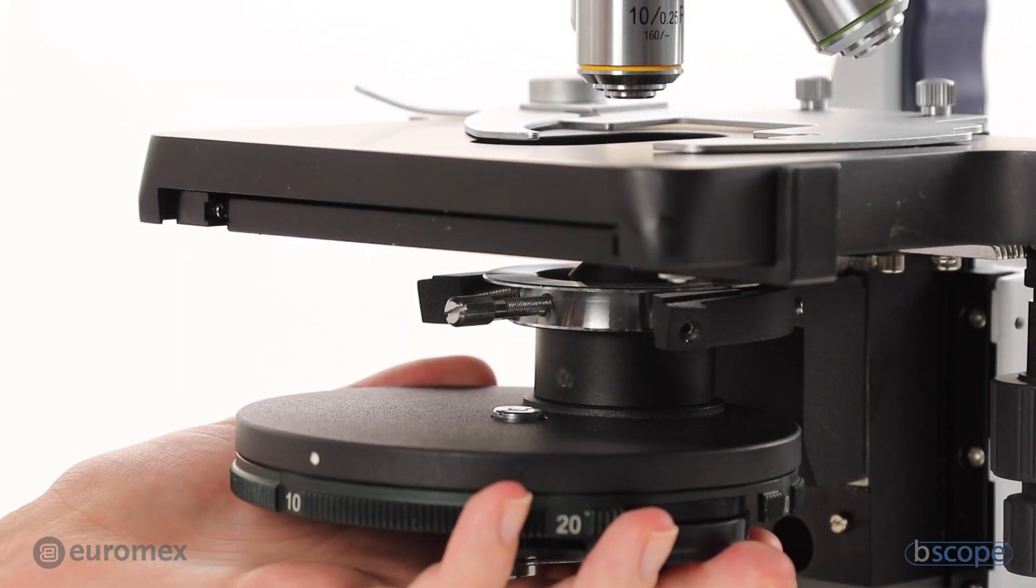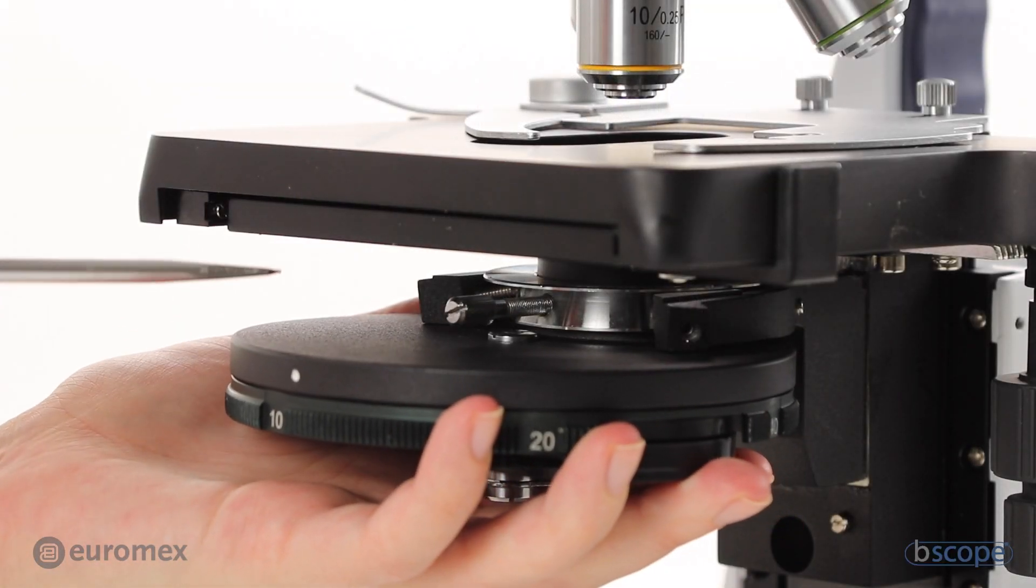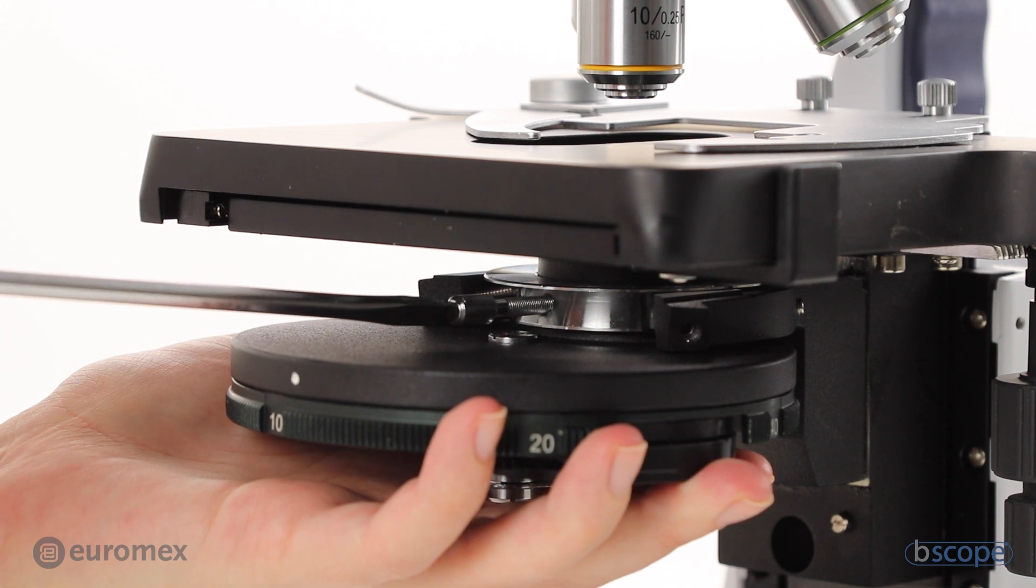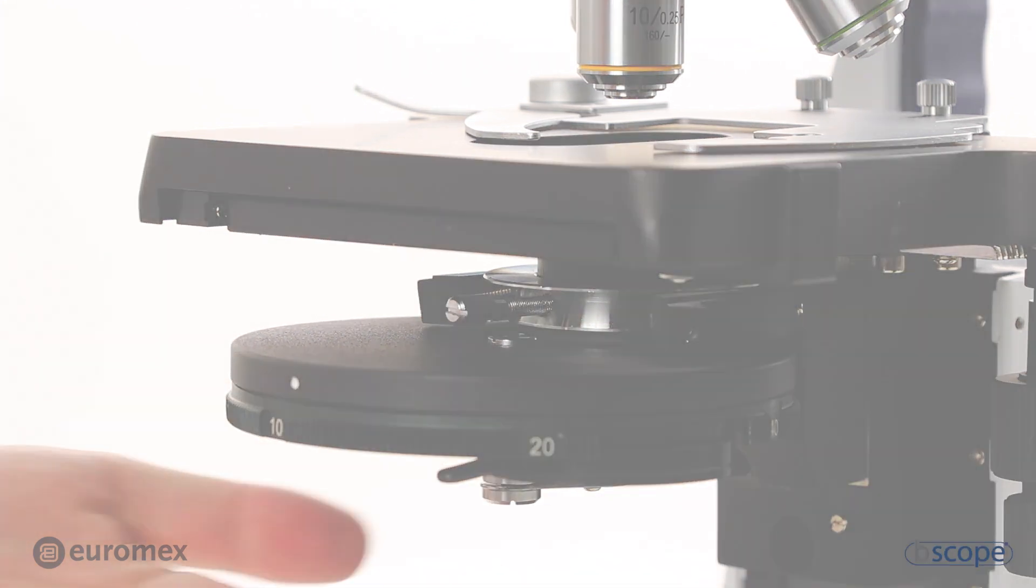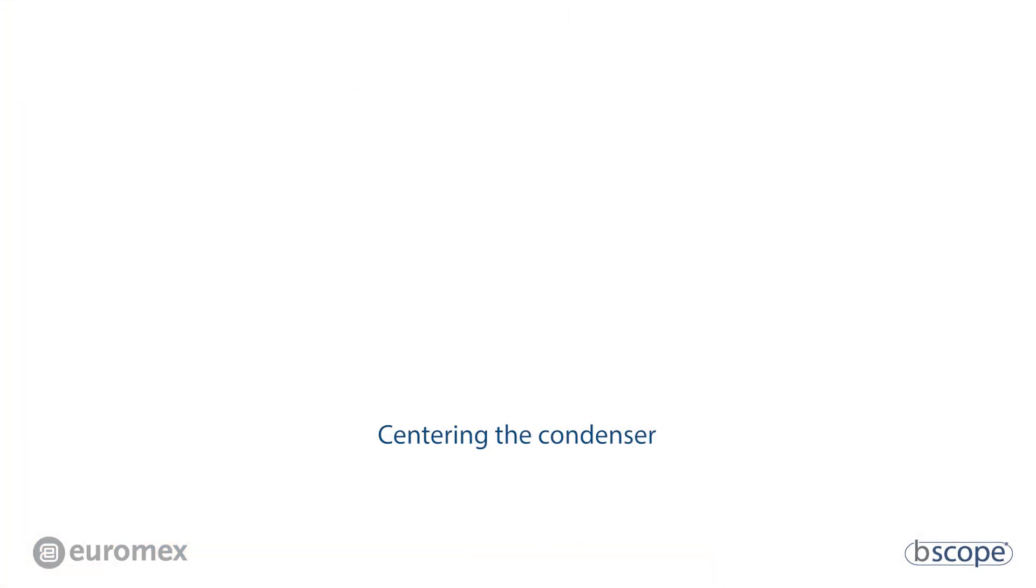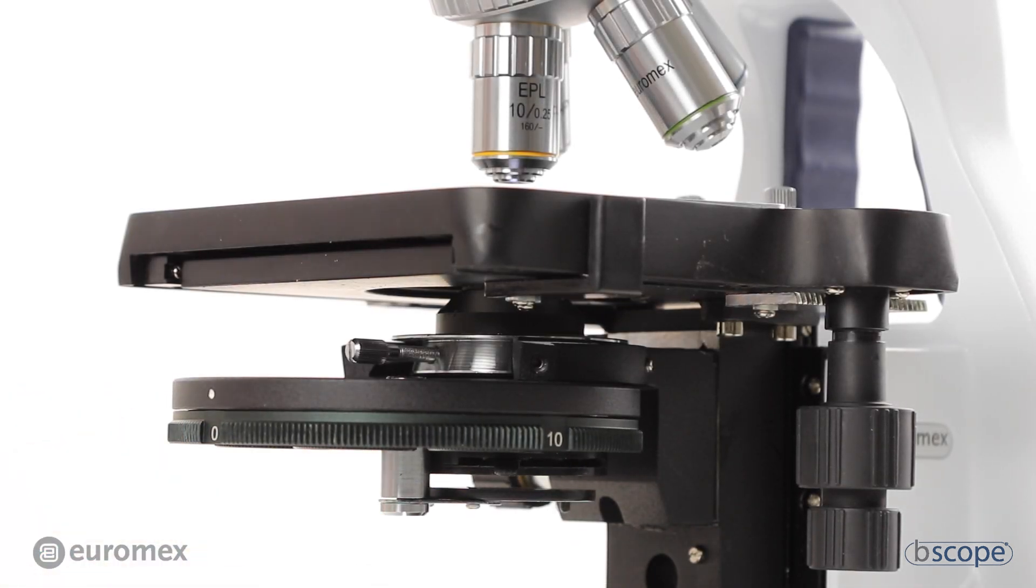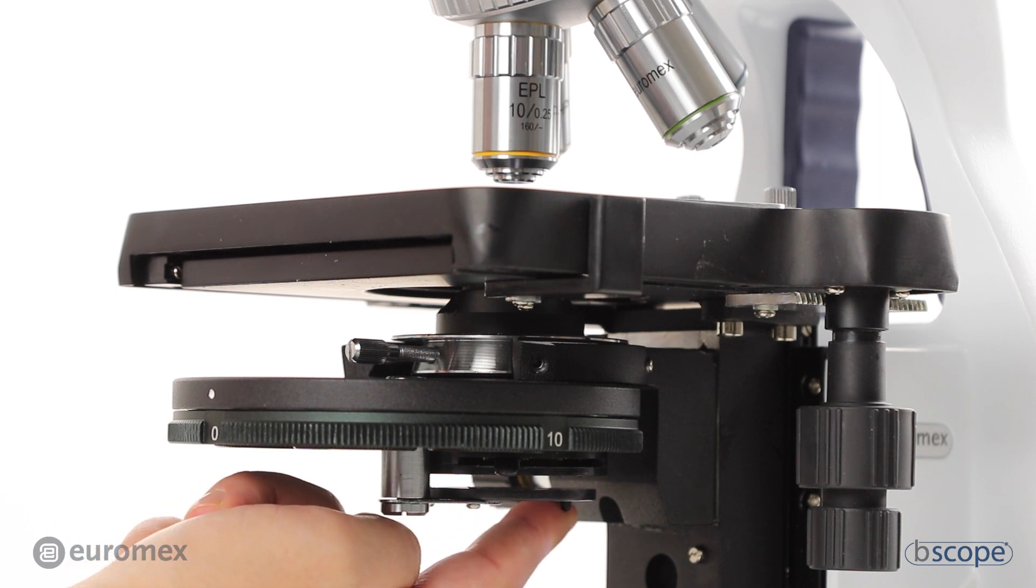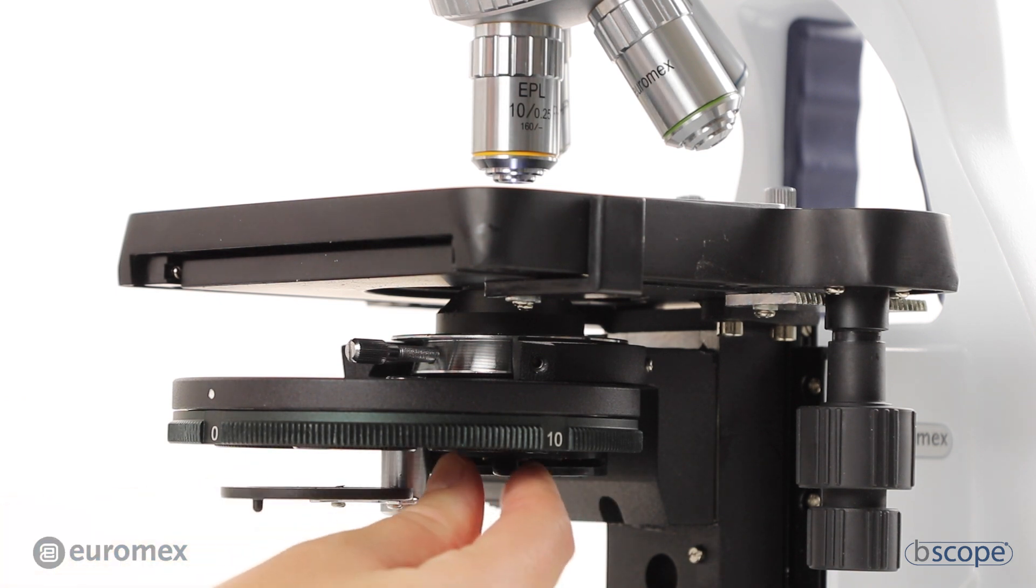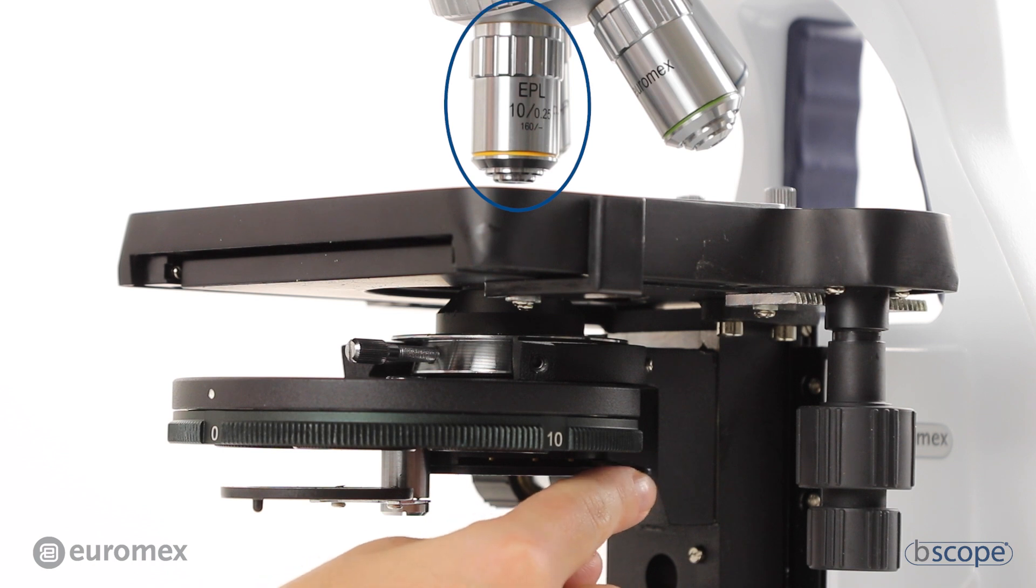Fit the Phase Contrast Condenser underneath the stage. Turn the selector to 0. Take the white filter out of the light path. Close the iris and make sure the smallest magnification is in place.